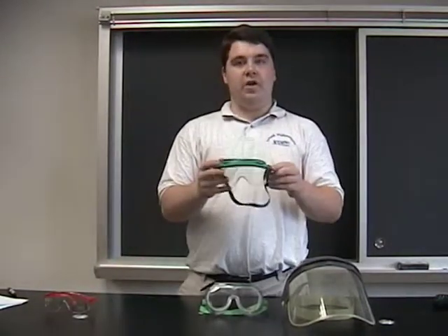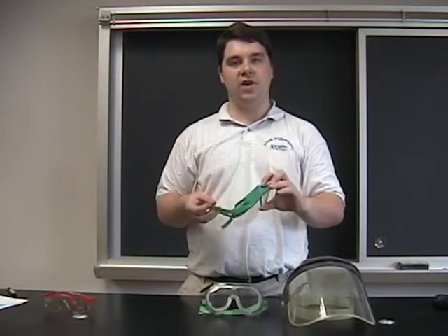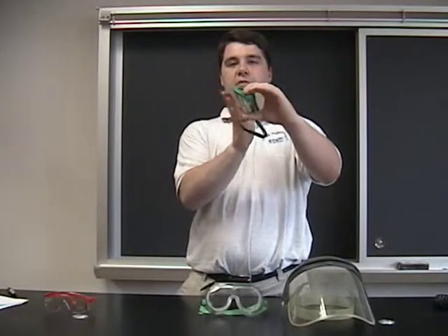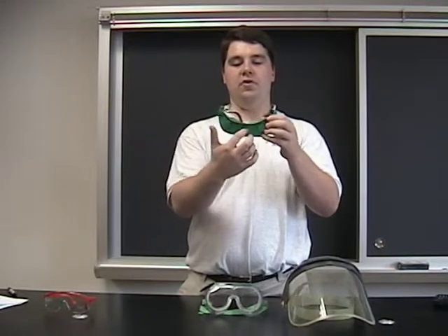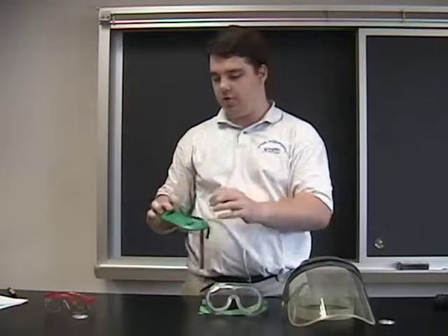The next type are visor gogs. These you will probably find more commonly in a college laboratory. It's a slanted faceplate, and there is more coverage up top to protect you in case chemicals drip down, and there's an adjustable strap for you to wear.